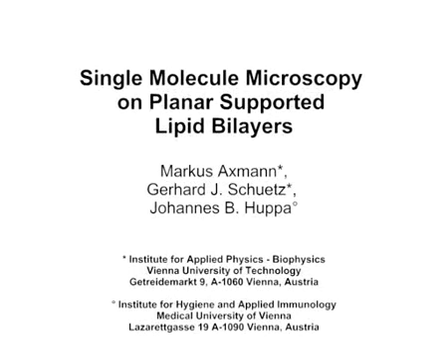In this video, we will show how to prepare and characterize biofunctionalized planar supported lipid bilayers. We will also describe in detail the architecture of a total internal reflection microscope with single molecule detection capabilities. We will measure the excitation power density, the fluidity and the protein density of the lipid bilayer.